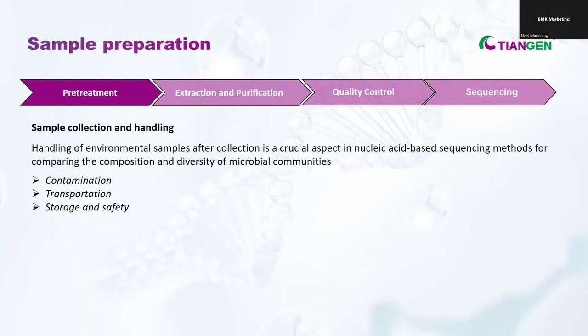So microbiome research typically follows a structured workflow encompassing sample collection, laboratory procedure, sequencing, and bioinformatics analysis. While each location has different environmental characteristics, there are some basic procedures, principles, and techniques for collecting and handling samples that are key for the reliability of a laboratory analysis.